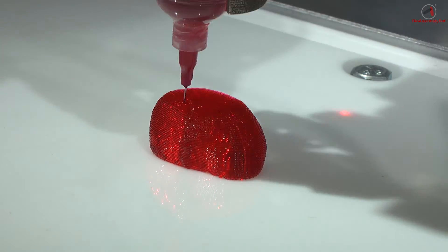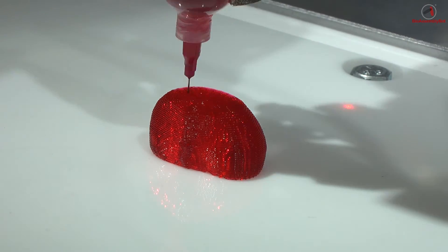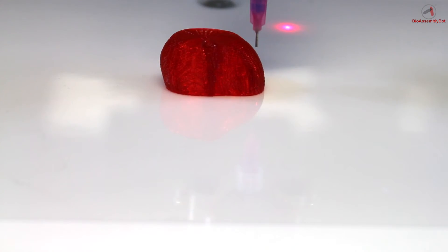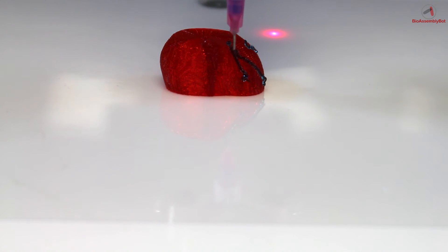Once completed, BAB will go over, grab the other vessel hydrogel material, and then print that along its curved surface here as blue.